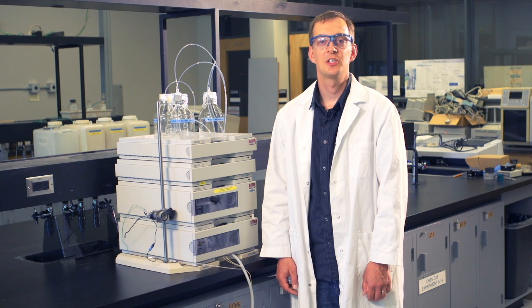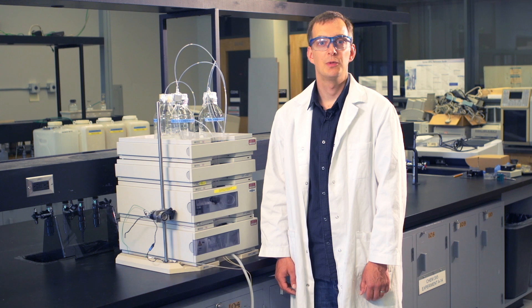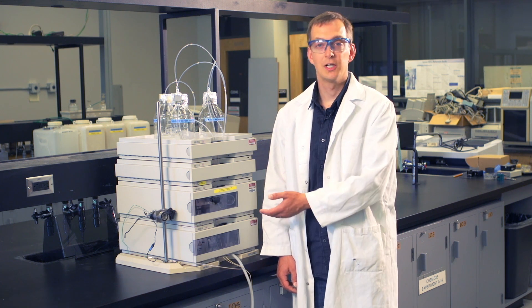Hello and welcome to the series of instructional videos for the third year analytical chemistry labs. I'm Dr. Robin Studley and this video will be about the instrumental setup for liquid chromatography.